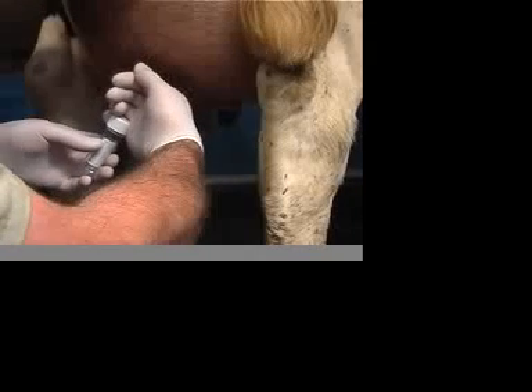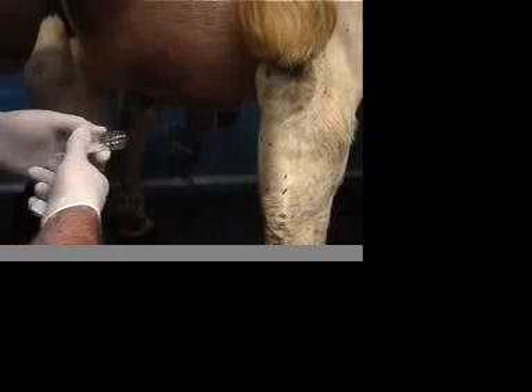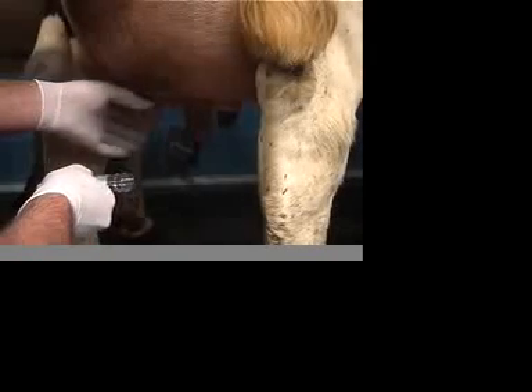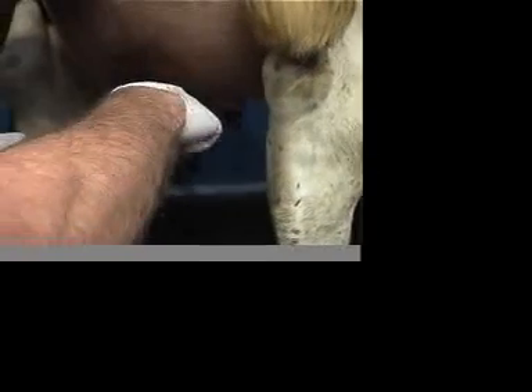Strip another few squirts to remove any disinfectant which may have got into the teat end during the cleaning process. Uncap the bottle as described earlier. Hold the bottle flat, and without touching the bottle with the teat end, draw three squirts of milk. This is plenty, and the small sample reduces the opportunity for contamination to occur.